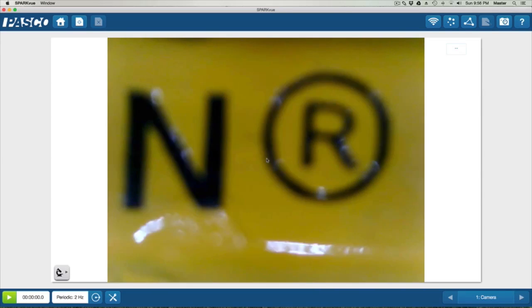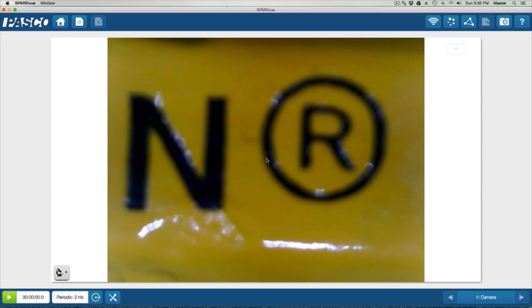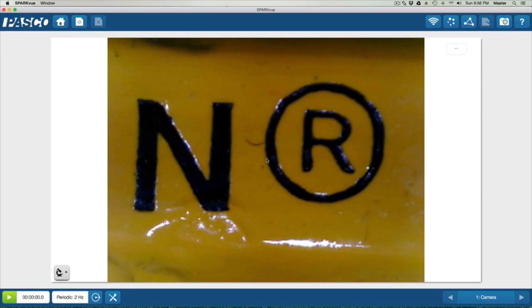Right now I don't have any macroinvertebrates, but I'm just going to use a pencil, and I'm going to stick it right underneath there. I'm going to use the lowest power to start with, and we'll get the number 2 pencil lead. Then I will just focus it as I find what it is I would like to do with it.